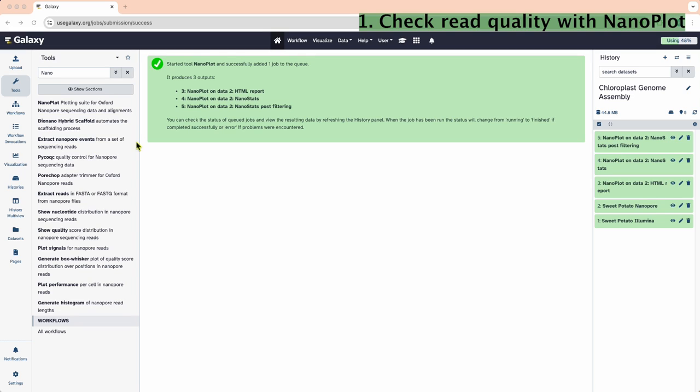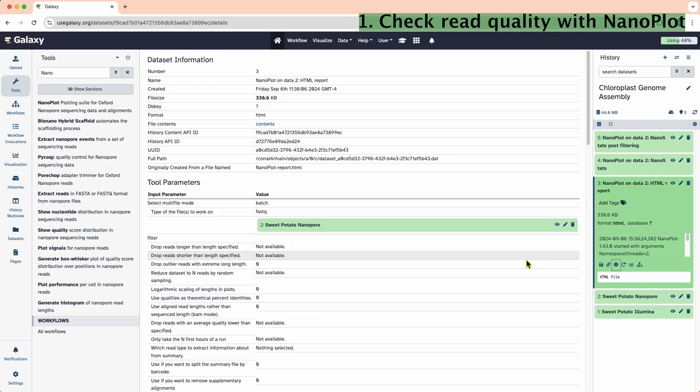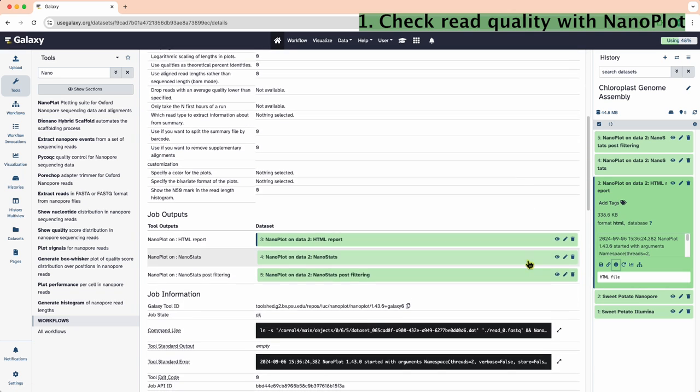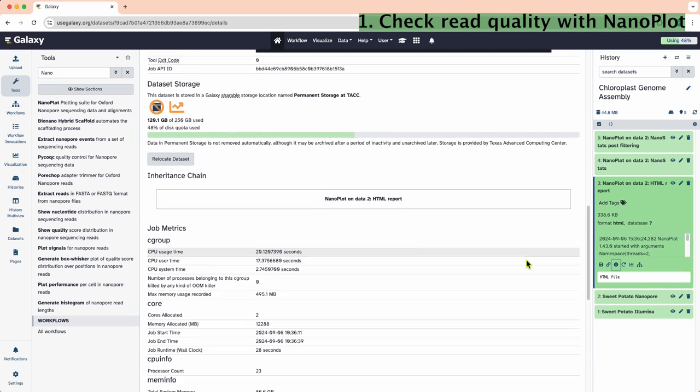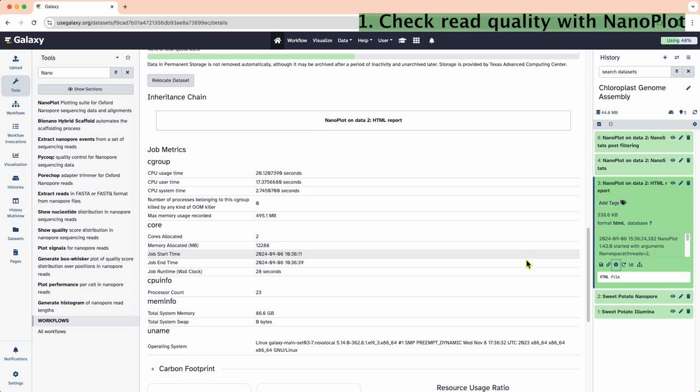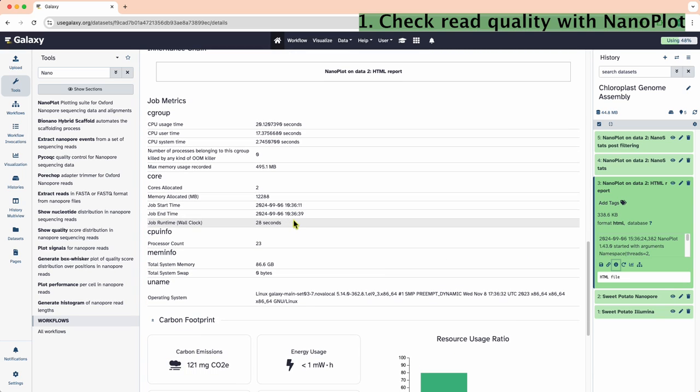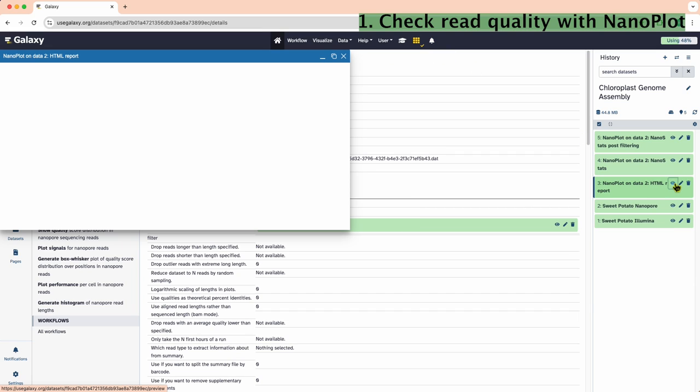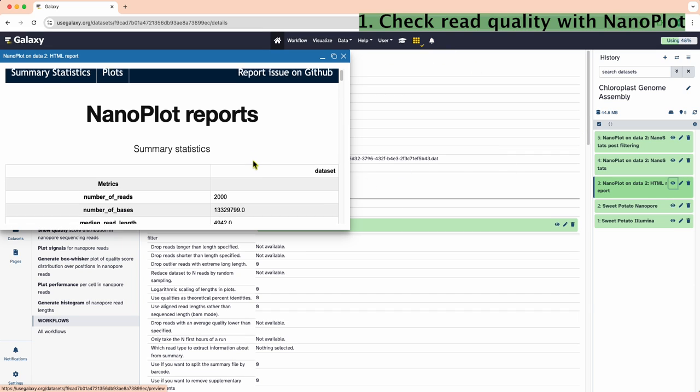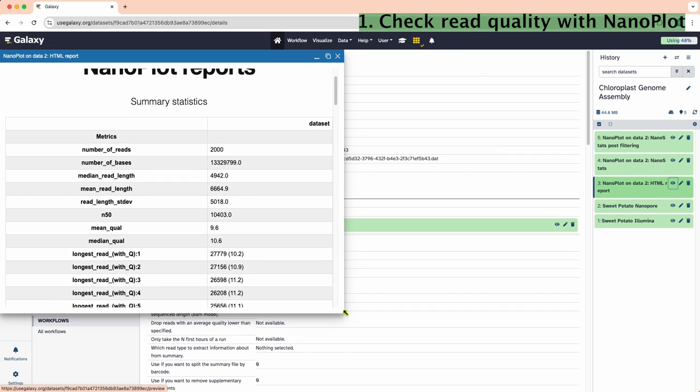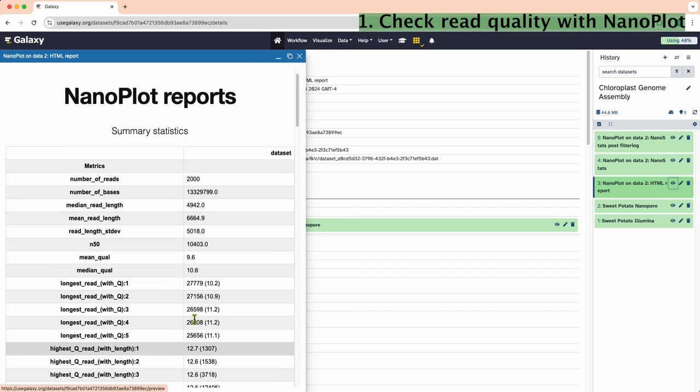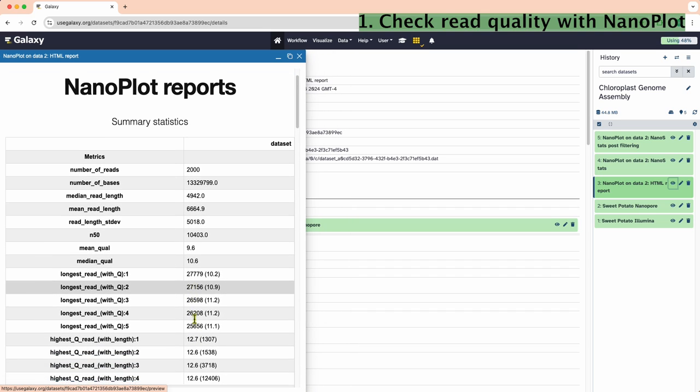Okay, the job is finished. Let's see what it did by clicking on the eye icon. This will show us all the details about the job. The job ran for 28 seconds. Now let's check the job output by clicking on the eyeball icon of the HTML report. We can find information about our fastq file here.